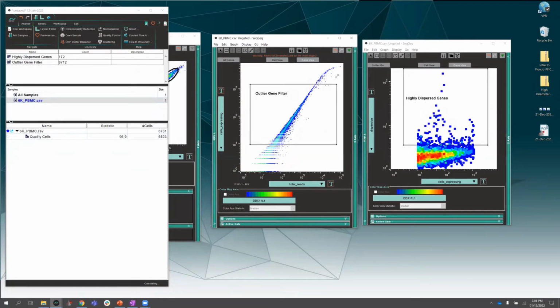And that's why it's nice to do the quality control yourself rather than leave it to an automated algorithm, because then you can see what's being kicked out and if you feel like you're kicking out too much, right? All right, so we've done our quality control.